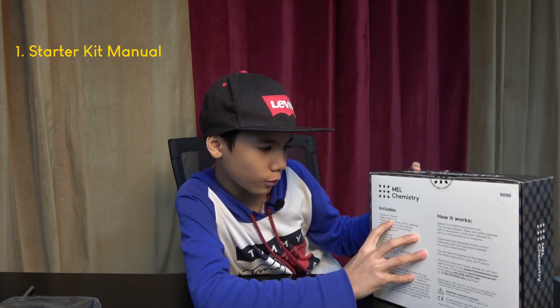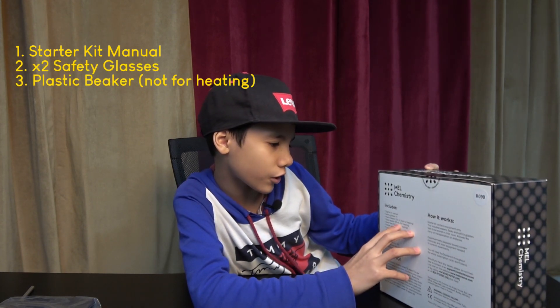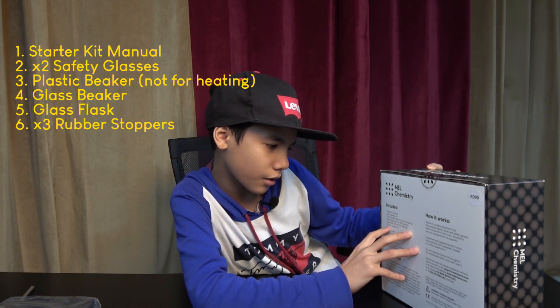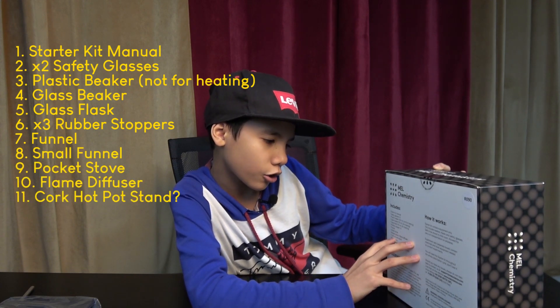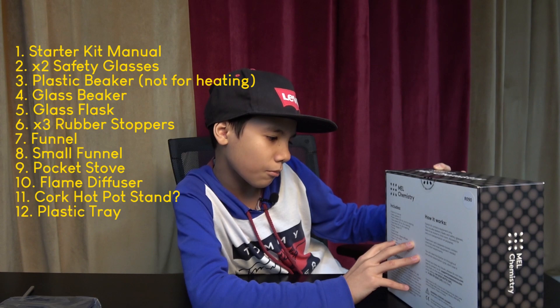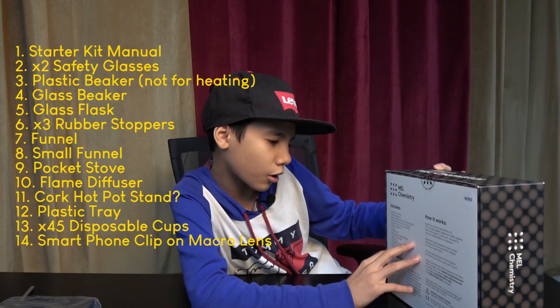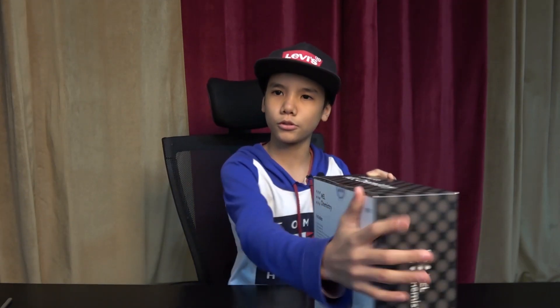The starter kit includes: a starter kit manual, two safety glasses, a plastic beaker (not for heating), a glass beaker, a glass flask, three rubber stoppers, a funnel, a small funnel, a pocket stove and flame diffuser, a cork hot pot stand, a plastic tray, 45 disposable cups, a smartphone clip-on macro lens, and a smartphone stand.